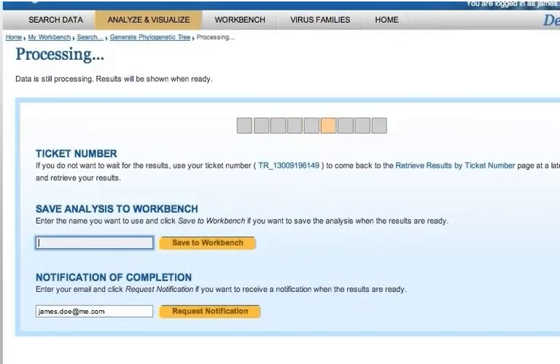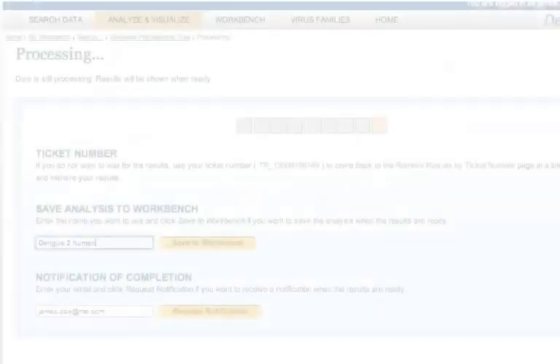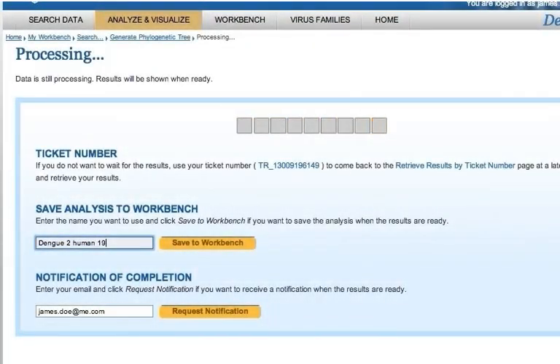Some analyses take longer to complete, especially when there is a large number of inputs. While an analysis is running, you can choose to save it upon completion to your workbench and then navigate to other parts of the site. To do so, enter a name and then click Save to Workbench.